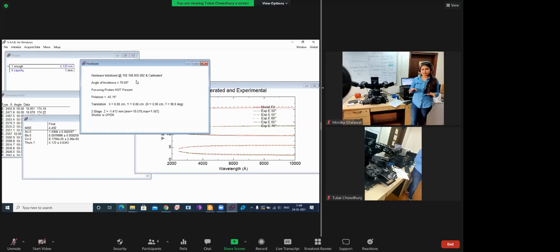For example, you want to go for some measurement in ellipsometry in some other lab. Before that, you want to know whether your samples are optically smooth or not. There is a very simple experiment which you can do. I will show you. Everyone has pointers in their lab, so I will show you how you can see.